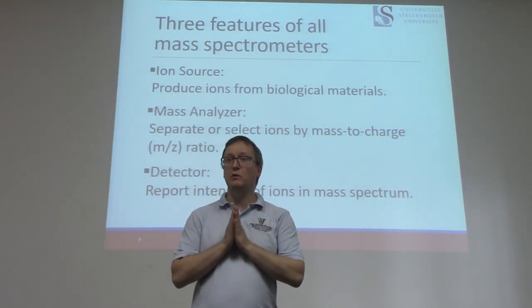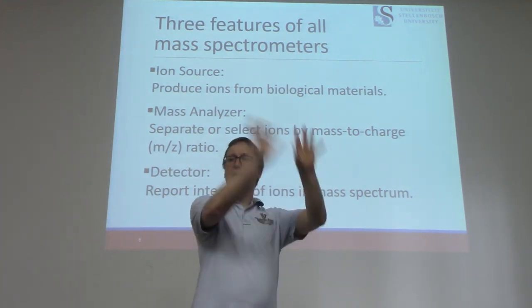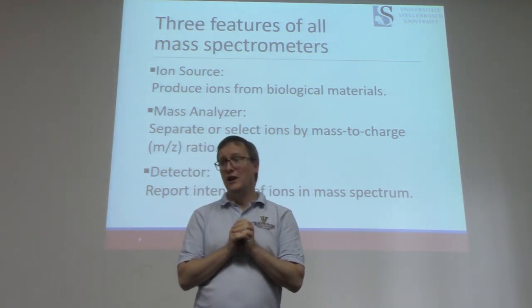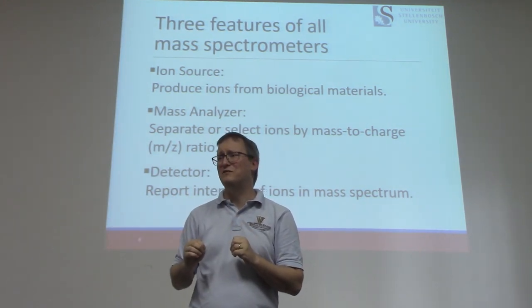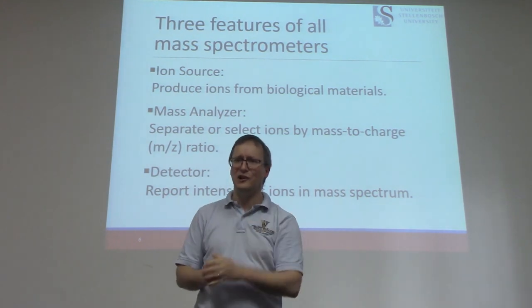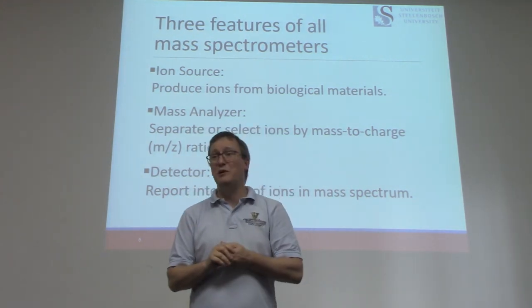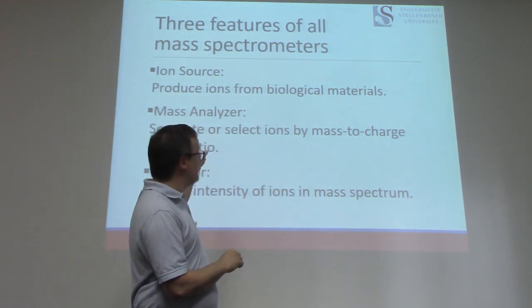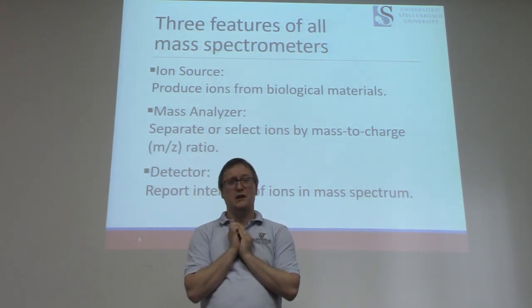Most frequently, we work with something called MALDI, which involves zapping things with a laser and creating a plume of ions, or we make use of something called electrospray, where we have a liquid flow from chromatography and we apply a few thousand volts to it to get these peptides to take on charge. So MALDI or ESI actually is one of the only Nobel Prizes that's been given in this space, so it's a big deal.